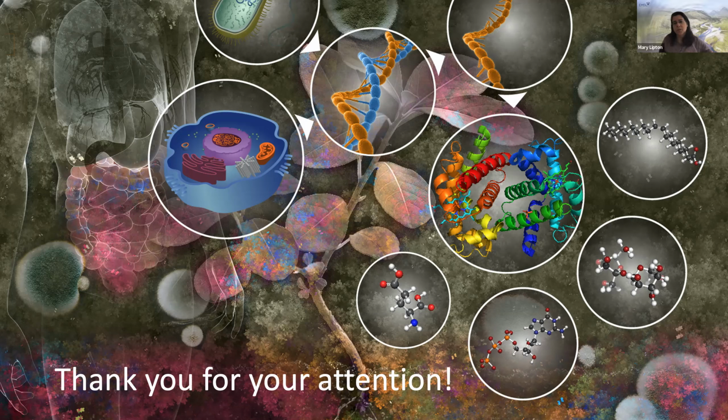Okay. I know there's a number of binning techniques. I think they use the tetramer, the tetrameric. It's a technique where you look at the nucleic acid words, and you see how closely they align. And then once you get the nucleic acid usage collected, you look and see if you can find any of the ribosomal genes to figure out what the taxa is. I know there are different methods out there, but I usually use what people give me.